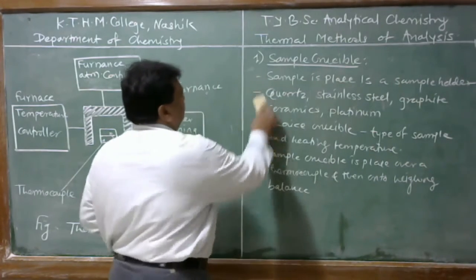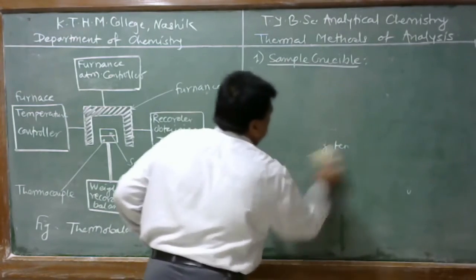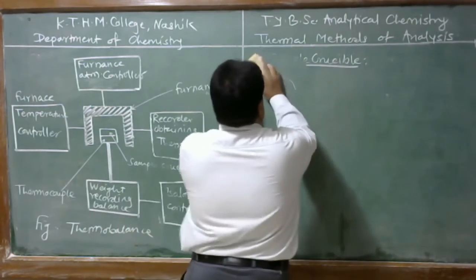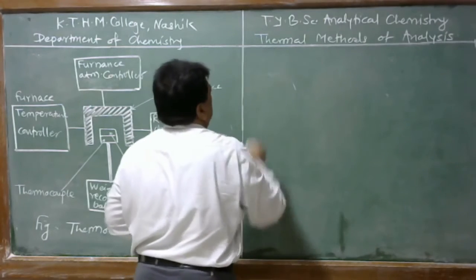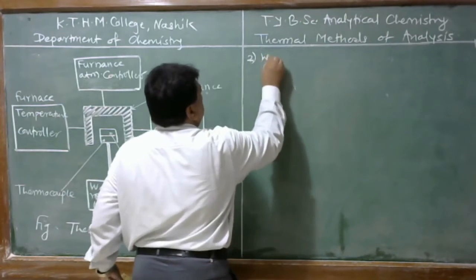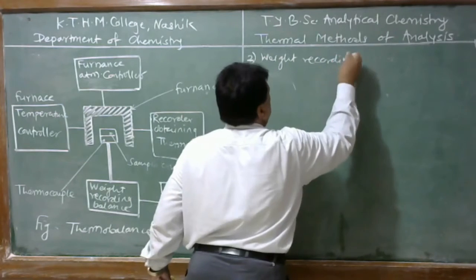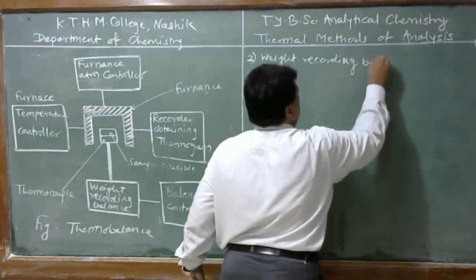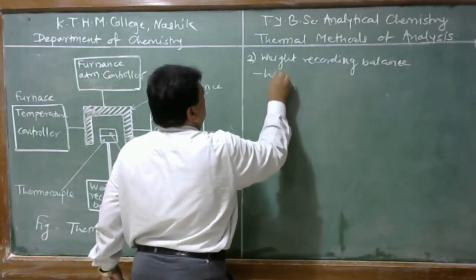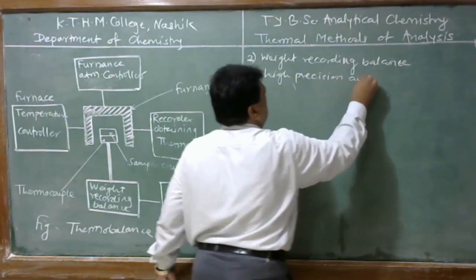Second component is the weighing balance, or weight recording balance. This is a high precision analytical balance.